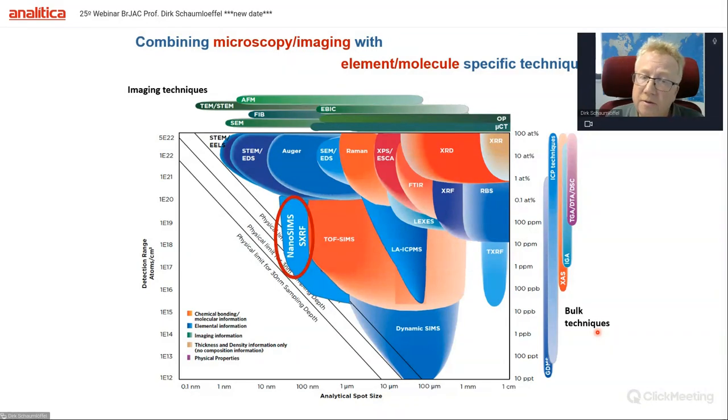So I will talk about NanoSIMS, but also, later, a little bit about synchrotron-XRF, which gives similar resolution depending on the beamline. I also will talk later, when we are talking about correlative techniques and other techniques, about TEM, ICP techniques, and also XAS for speciation analysis.